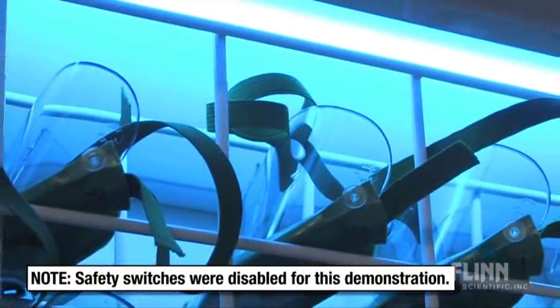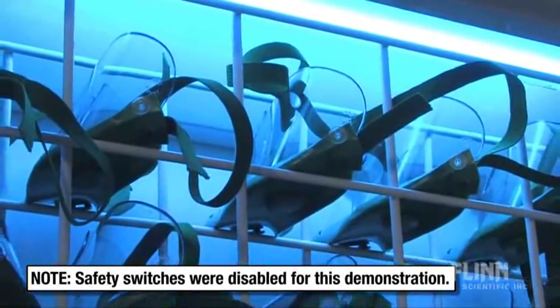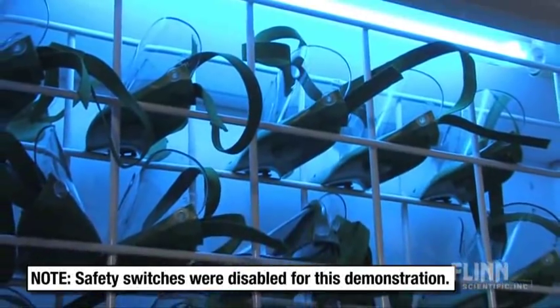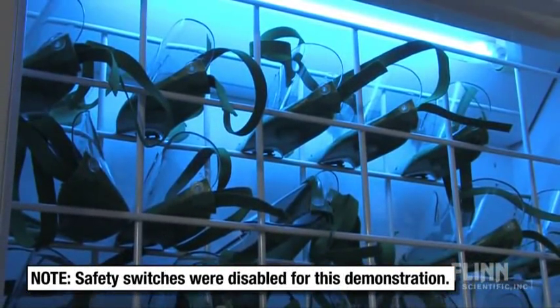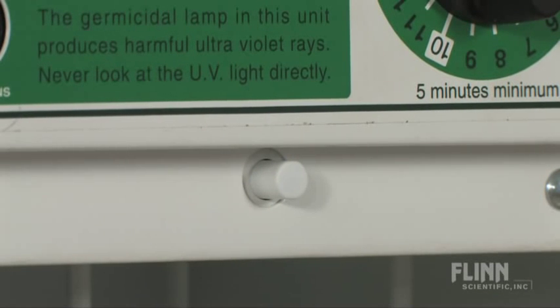To make sure this sanitizer will always function at peak performance, we have included a 25-watt high-intensity ultraviolet bulb. A five-minute exposure to UV light will kill over 99.5% of all bacteria present on the goggles. A key lock allows the doors to be secured during sterilization, and two safety door switches automatically shut off the UV light source if a door is accidentally opened.